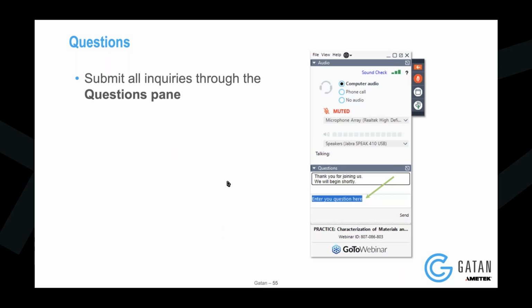I can maybe answer that question. Earlier in the presentation, I showed a bunch of phase retrieval techniques. I showed DPC, what I would call our direct ptychography methods, which include tilt-corrected bright field, parallax, and SSB, and then also iterative ptychography methods. In the order I just listed them, they scale with computational demand. So DPC is great for lab in situ experiments, while iterative ptychography takes a little bit longer and requires GPU accelerated resources.